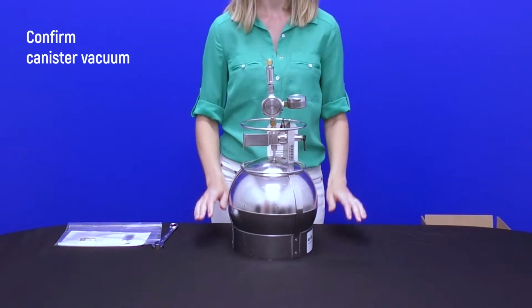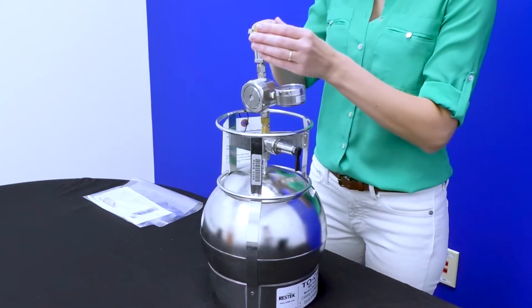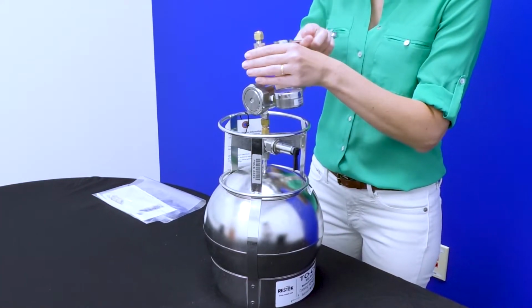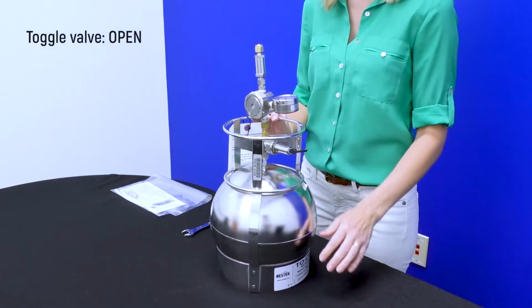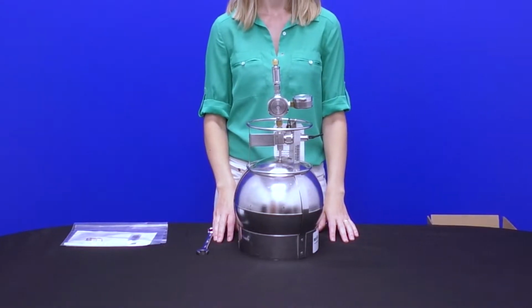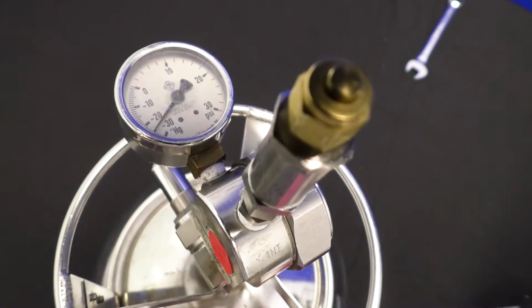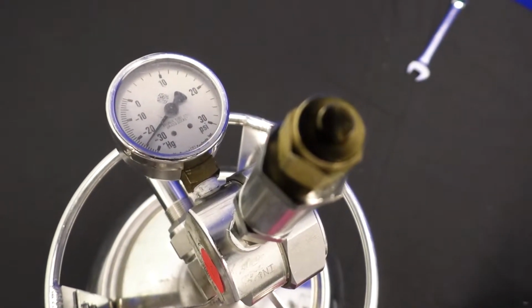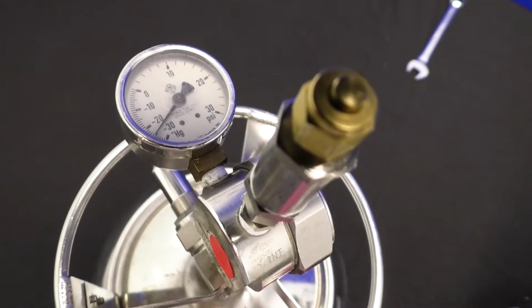Next, confirm canister vacuum after transport. Make sure that the brass cap is on tight. Then flip the toggle valve to the open position. If your can has a rotary valve, turn one full rotation counterclockwise until you meet resistance. The gauge needle should now drop to between -25 and -30 inches of mercury of vacuum. If it does not, there is a problem, and you should reach out to your contact at Pace.